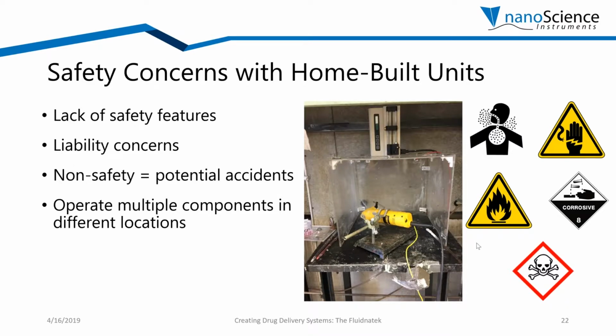This brings safety concerns, especially because we're operating at high voltage. You could easily be using organic solvents that are flammable, toxic, and can cause health issues if proper ventilation is not provided. If they are used in a university, this could bring liability concerns due to exposing the students and researchers to all these non-safe aspects.